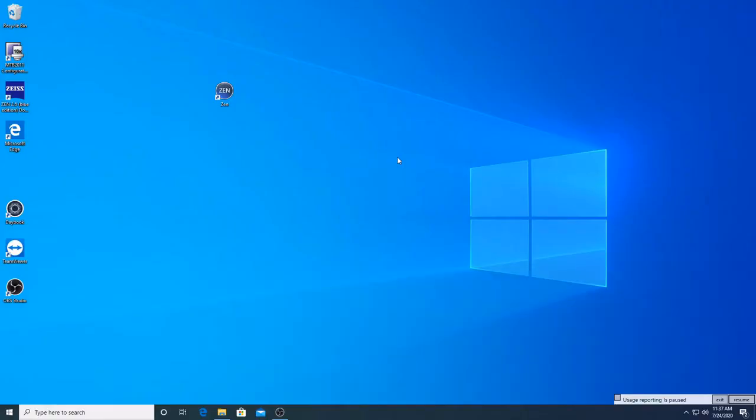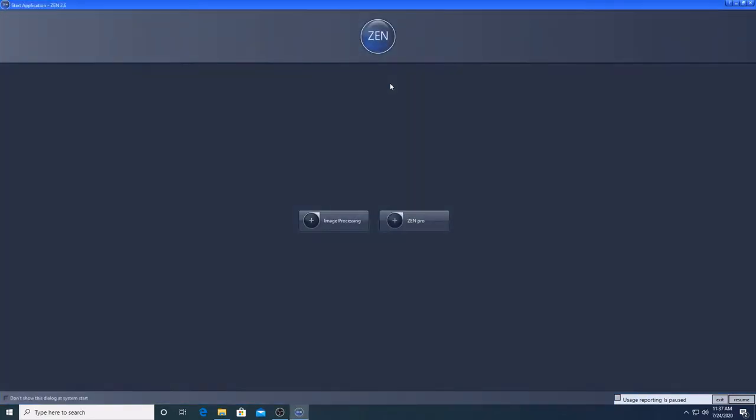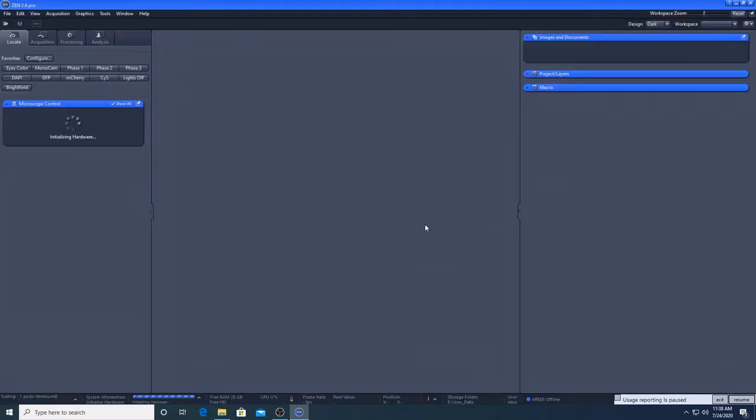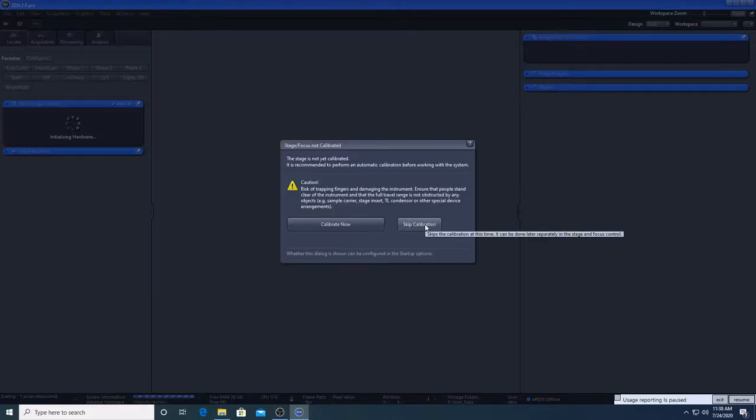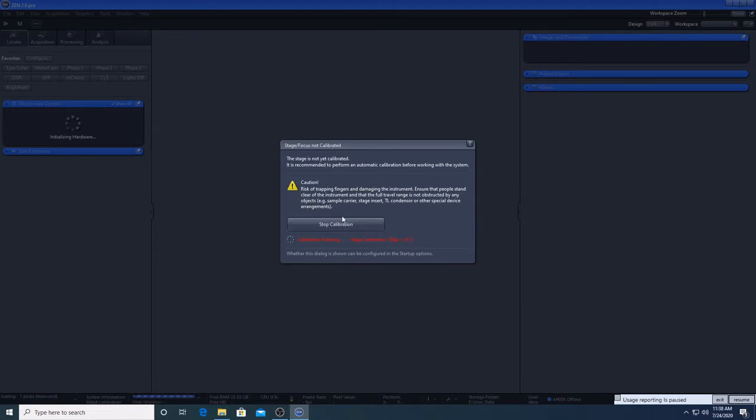We will be using the Zeiss software Zen Blue to acquire images with the Axio Imager microscopes. Double click on the icon to start it, then click Zen Pro. If it asks you to calibrate the stage, go ahead and click calibrate now.